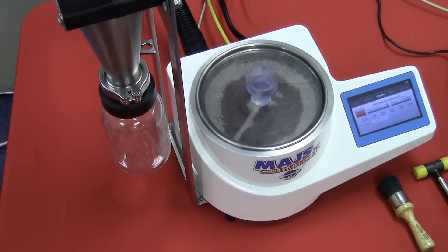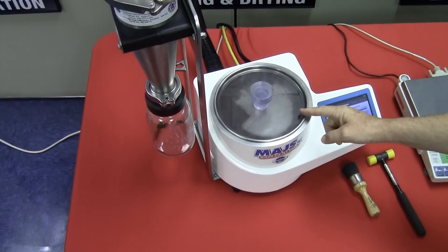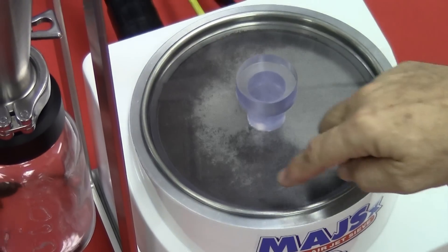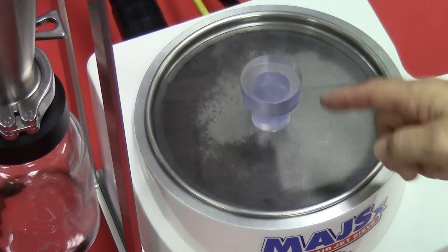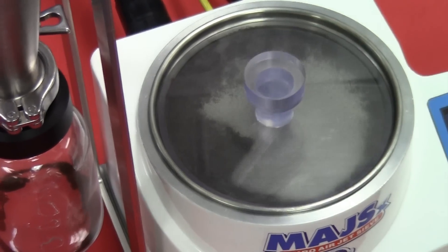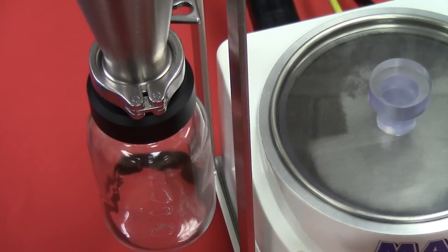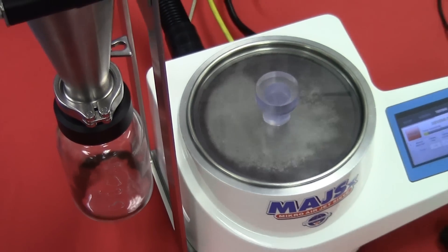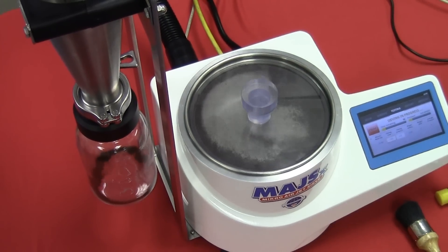Now the unit is coming up to proper vacuum pressure. Once the vacuum pressure is reached, the wand will begin to rotate, as it's rotating now. As it rotates, the fine particles passing through the screen are carried in the airstream up to the cyclone where they're collected. The efficiency of the cyclone is 99% at 10 micron.